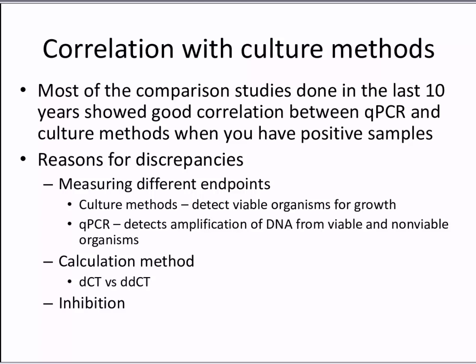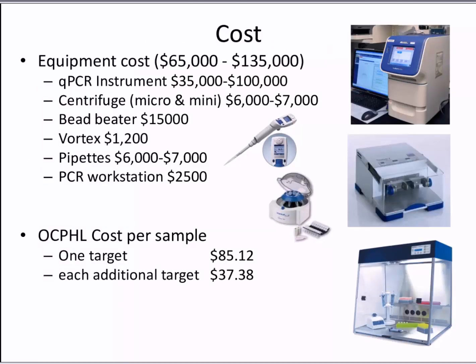So now I'll switch and talk about disadvantages. One is the cost. I just want to mention a disclaimer: our lab does not endorse any of these products. I just want to put that out there. These are just the ones we happen to be using. And then the costs are just our estimated costs based on what we had to pay for these items. And then when you look at the per sample cost, that only includes labor and consumable supplies.